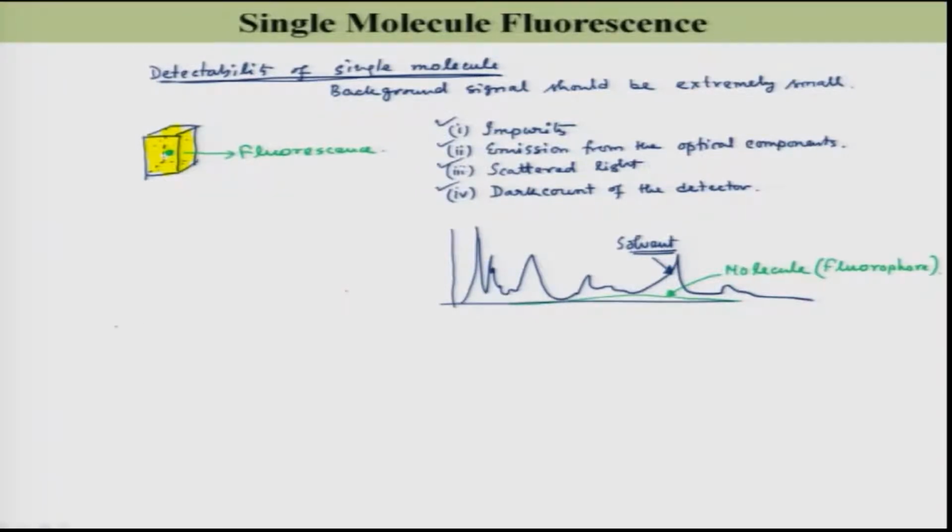This is important. Okay, let me give you one specific example, then this will be more clear. Let us say that I have taken one molecule, this is called rhodamine 6G, let me represent it as R6G, in some solvent. Let us take this solvent as ethylene glycol. If I have to represent the emission characteristic of this rhodamine 6G, what information should I give you?